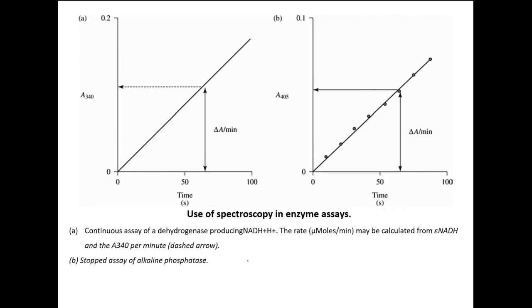Okay, so enzyme kinetics, that is, the rate of the enzyme, how fast the enzyme converts substrate into product, can be studied by using simple UV visible absorption spectroscopy. The only thing is you have to use a specific wavelength of light that you should know before you start your experiment, for which a literature survey will be of great use.